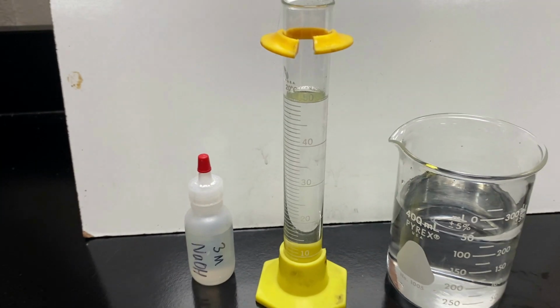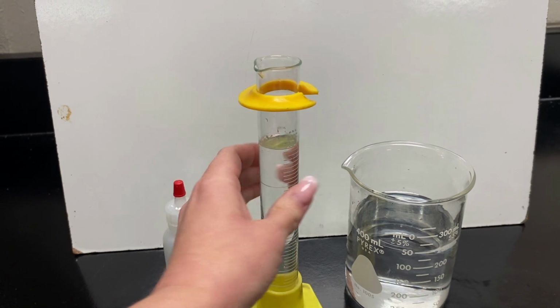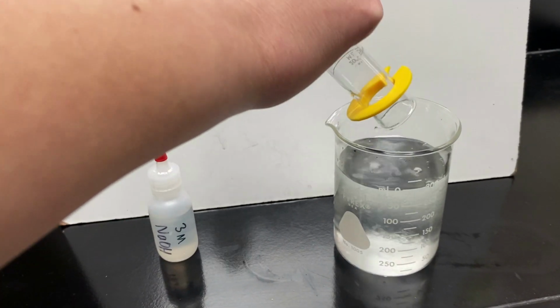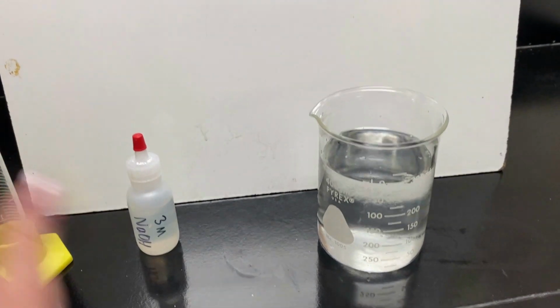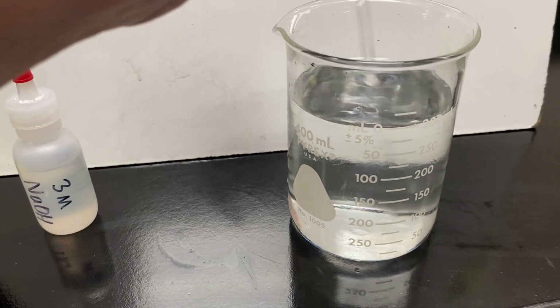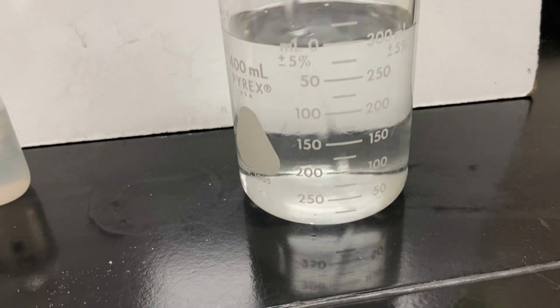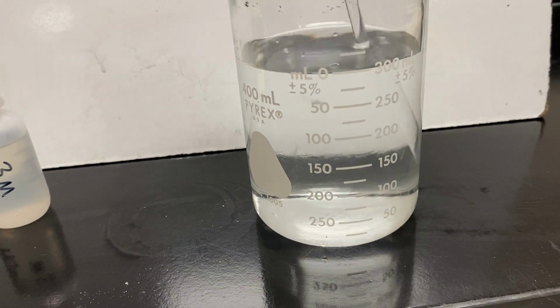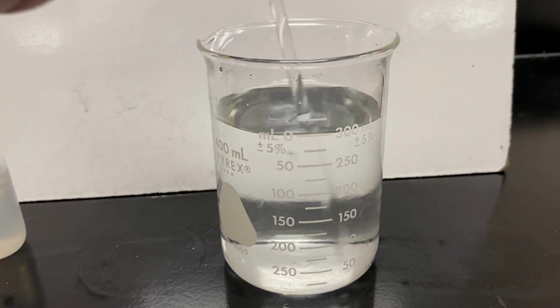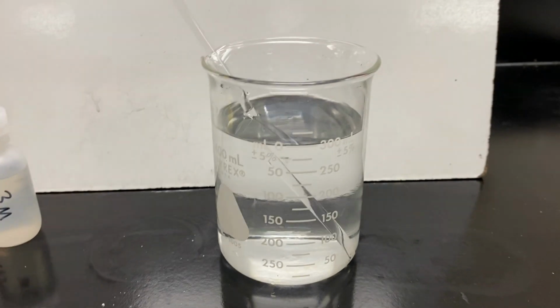I went ahead and already measured it. Now all we have to do is combine these two together, give them a good stir, make sure that we are properly labeling it and putting it into a container so we can put it back on our stock shelf. I will say that it is always best to measure your liquids in either a graduated cylinder or even a volumetric flask. I did not have a volumetric flask, so I just used a beaker today.